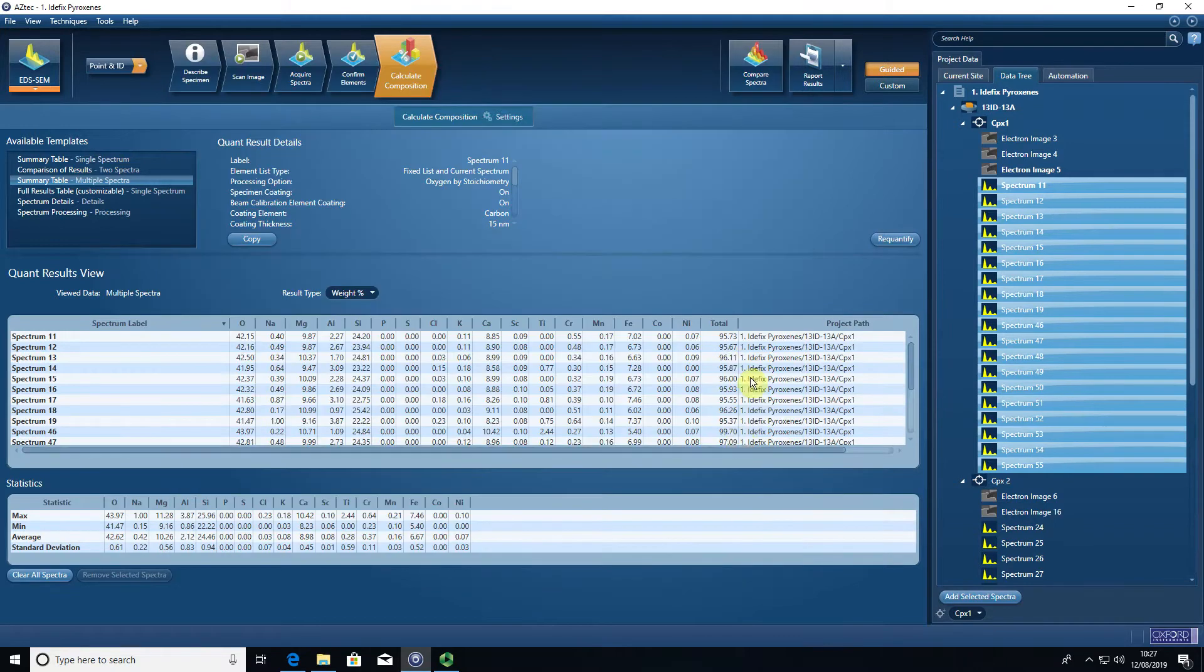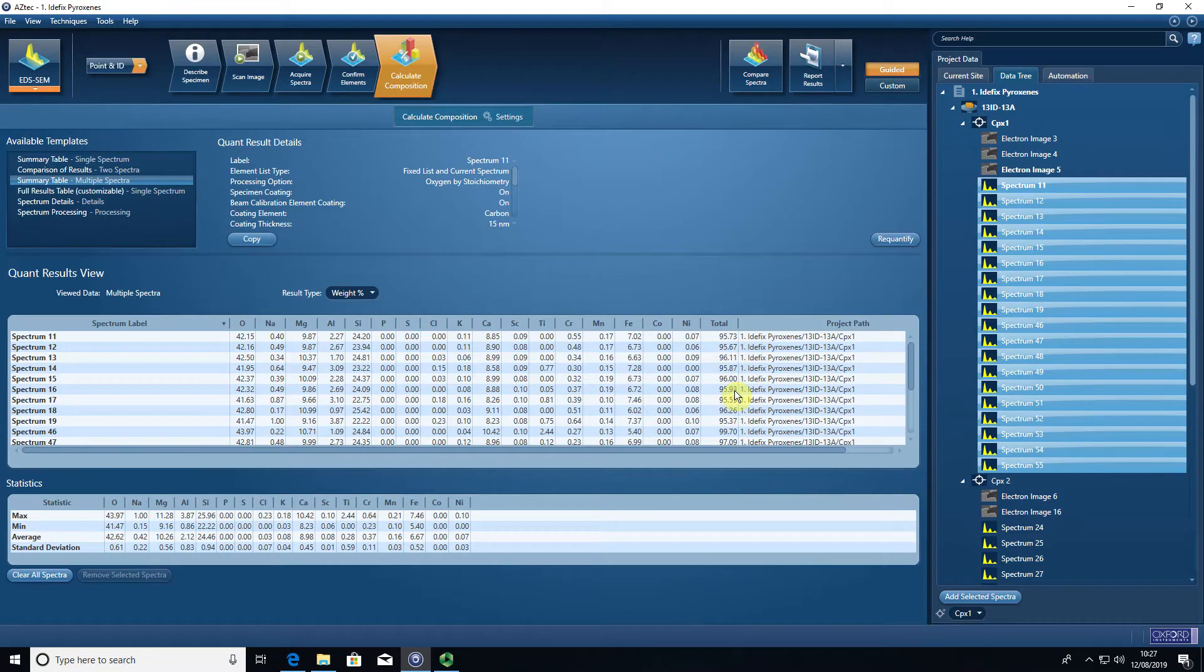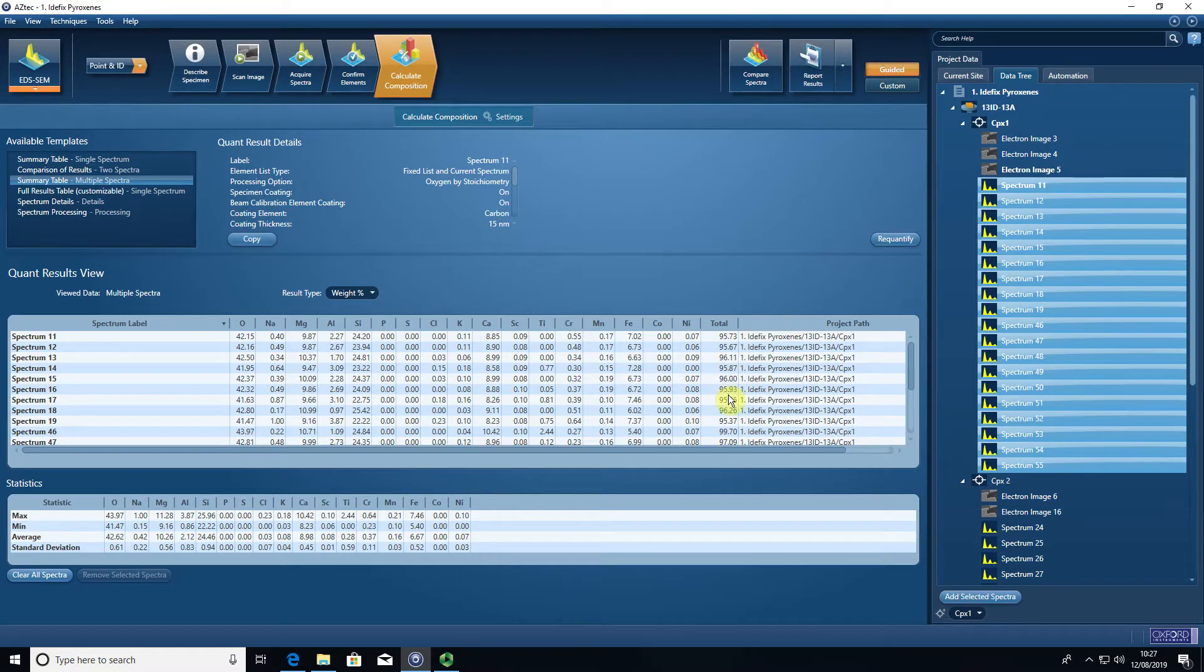Having done that, you can see for these pyroxenes I'm not actually using the correct standardization, so my total is a bit low. If you are measuring pyroxene with your standardization having just done the beam measurements on the acquisition computer, your totals for pyroxene should be around about 100% plus or minus one to one and a half percent.